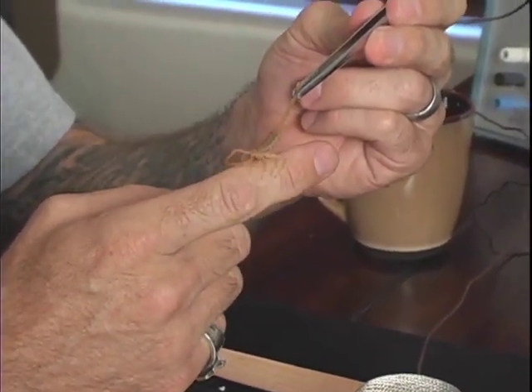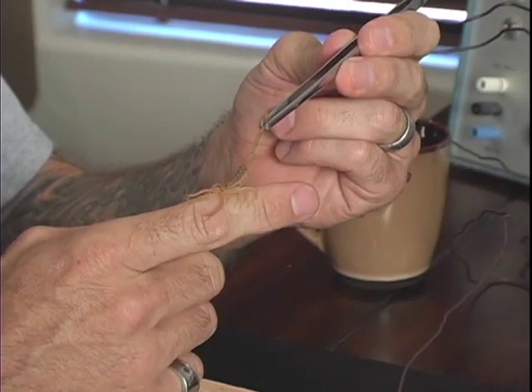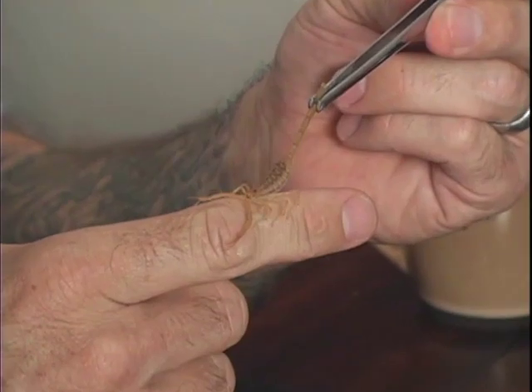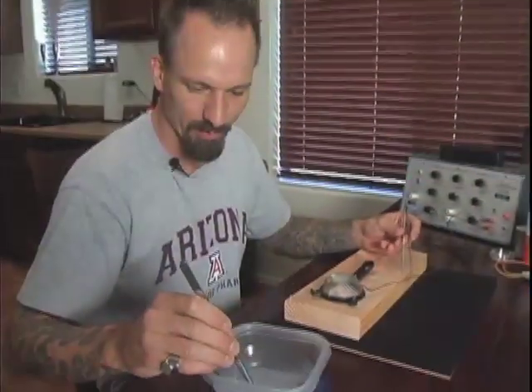The only way a scorpion can hurt you is by stinging you with the tip of its tail, called a telson, and injecting venom. The scorpion's pinchers are quite weak, so if I use forceps to hold the scorpion by the tail, it can't hurt me.